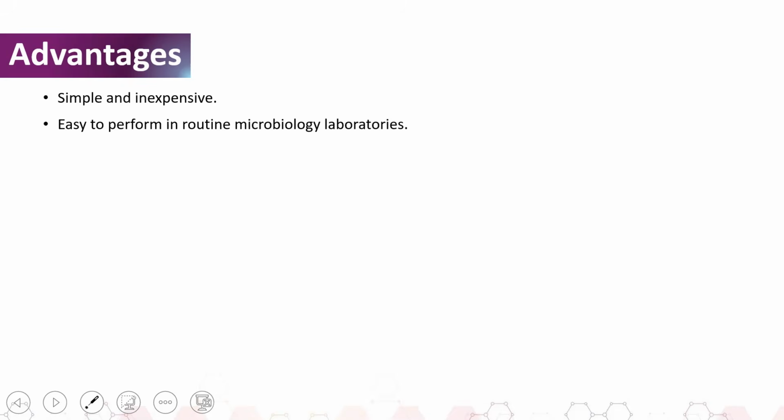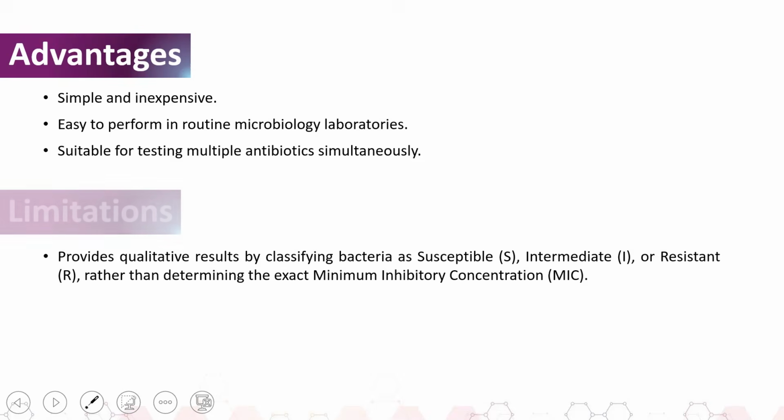Now let's look at the advantages and the limitations of the disk diffusion method. So let's start by looking at the advantages. 1. This method is simple and inexpensive. 2. It's easy to perform in routine microbiology laboratories. And 3. It's suitable for testing multiple antibiotics simultaneously.